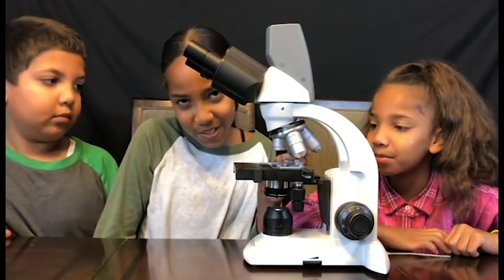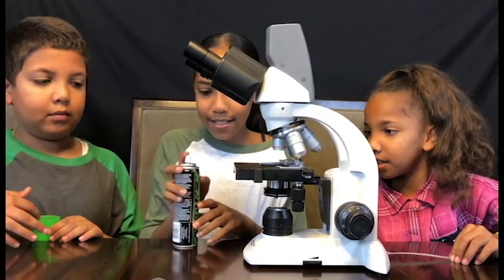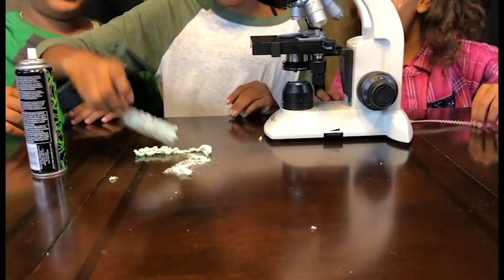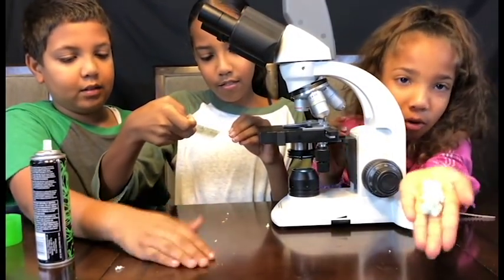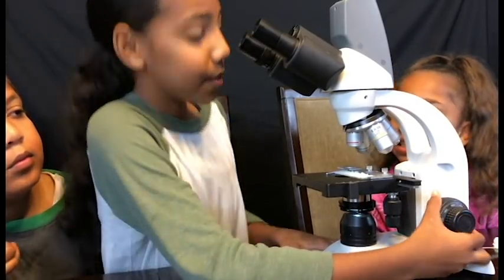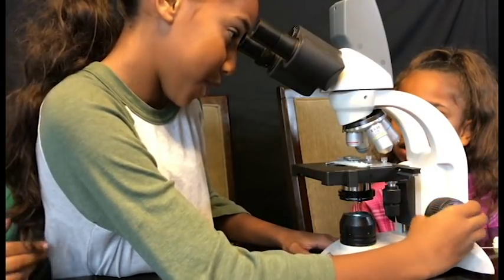To demonstrate, we're going to be using glow-in-the-dark silly string. We're just going to be spraying it onto the slide. Jasmine, I think that's too much. There we go. Okay, we'll see what that looks like on the microscope — she sprayed all of this on the table! So you're going to demonstrate to them how to use it. Now we're going to look through the microscope, using the knobs to adjust it.